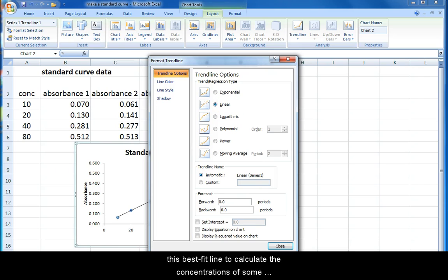Now select options. Because we're going to use this best fit line to calculate the concentrations of some unknowns, I would like to see the equation for this line on the graph. I also want to see how well this line fits, so I'm going to show the R squared values. And finally, I'm going to set the Y intercept to zero because a sample with no component A in it should have an absorbance of zero.